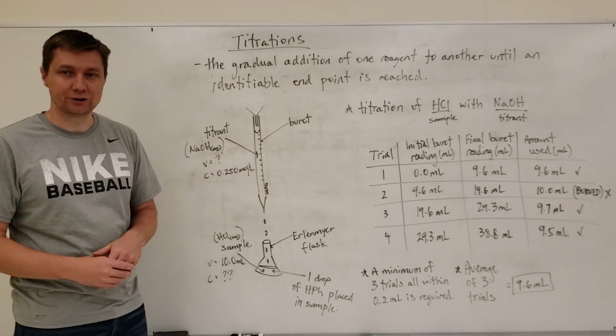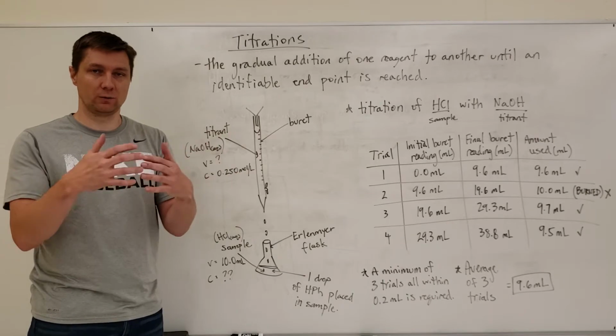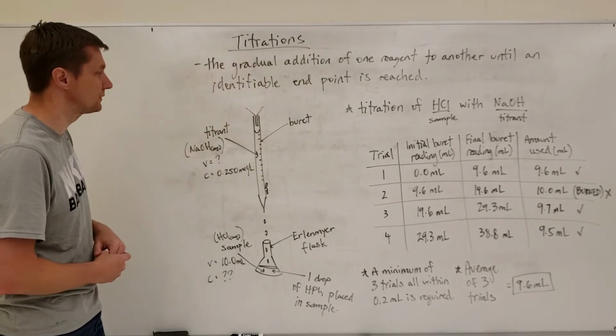So we're going to look at titrations, and all titration is, is where we take one reagent and we gradually add it to another until we can see that the reaction is finished. And that's really what this statement up here means.